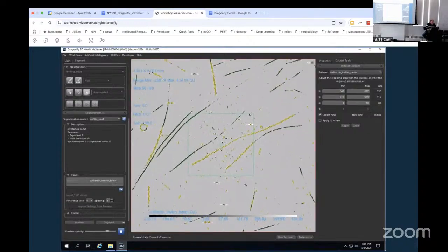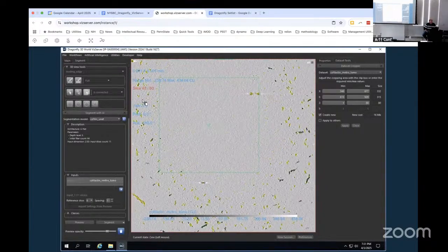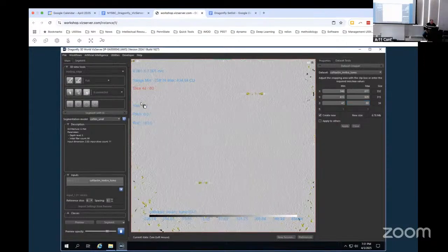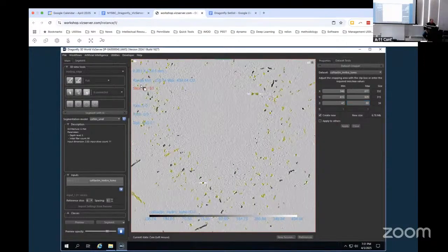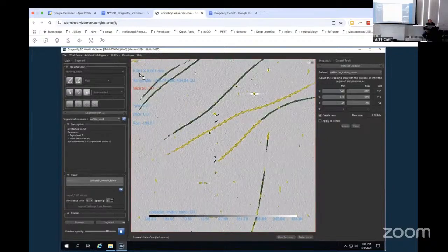But let's see. I'm going to try scrolling down to just below this junk. I'm going to say, okay, that's 47. How is that not right? It's not working. Somehow the bounding box is not syncing with that.